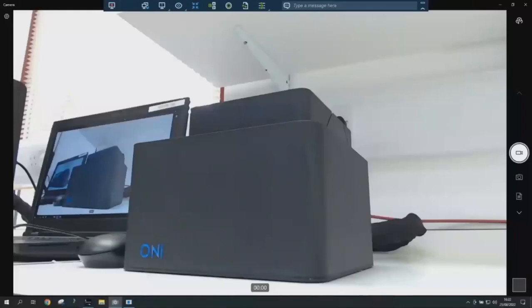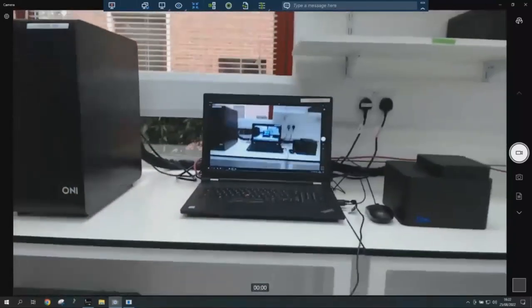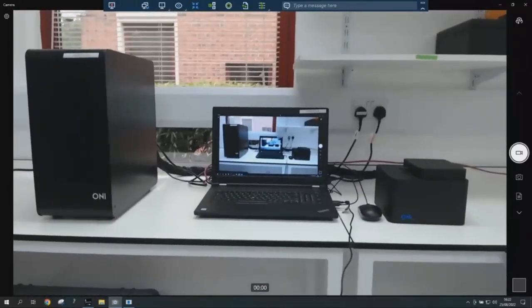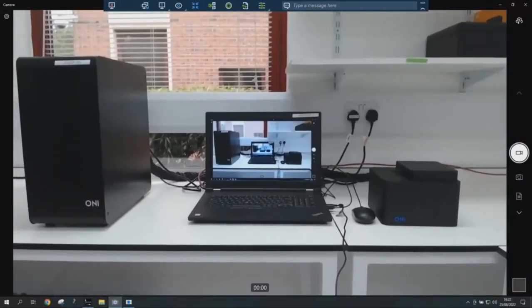Thank you, Peter, and thank you everyone for joining here the webinar on explaining the capabilities of the Nanoimager. I will show some of the highlights, and let me start with the first highlight, which is actually that the Nanoimager, the physical Nanoimager, is at the headquarters in Oxford together with the sample, while I am based in Germany and I'm accessing remotely. I will access the software remotely so that I can perform the acquisition directly from home.